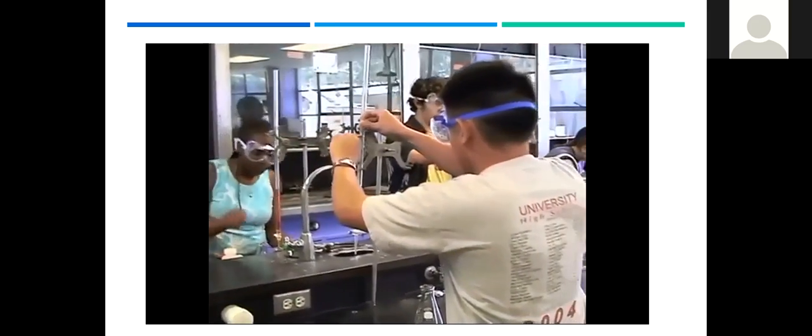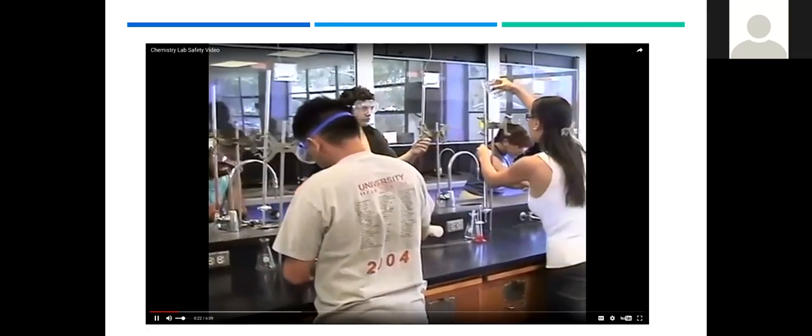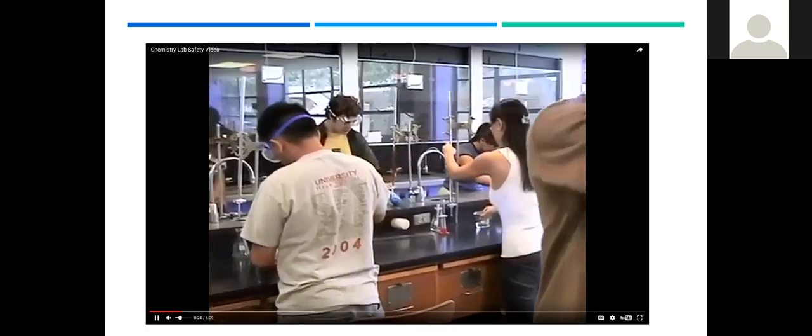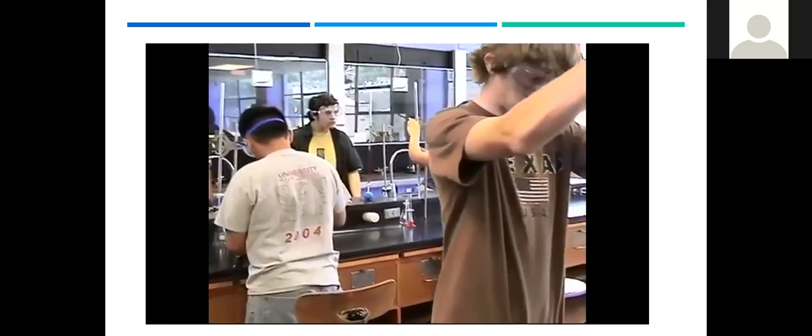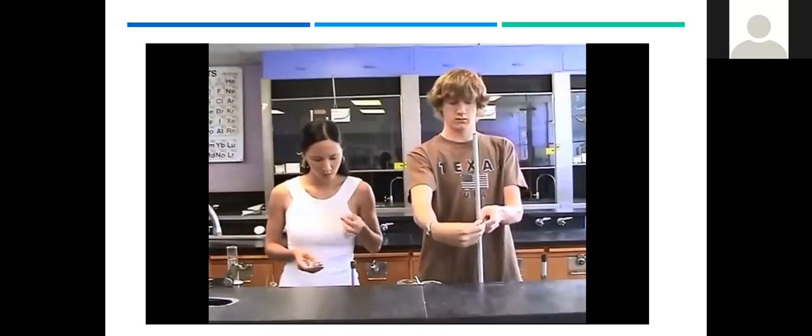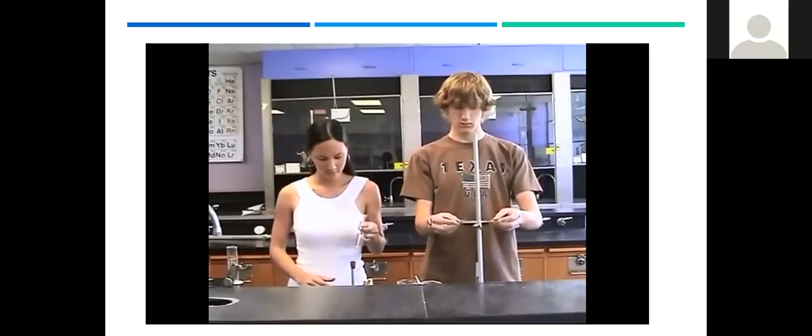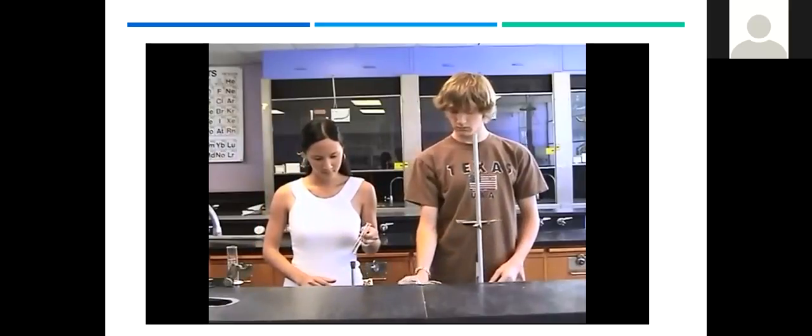The chemistry laboratory can be an interesting place. It can also be a dangerous place if safety rules are ignored. Your school knows that safety is important and so should you. These students are working in the laboratory without wearing their safety goggles. As you will see, this can be a very risky thing to do. Although you may be a very cautious worker, your neighbor may not be.